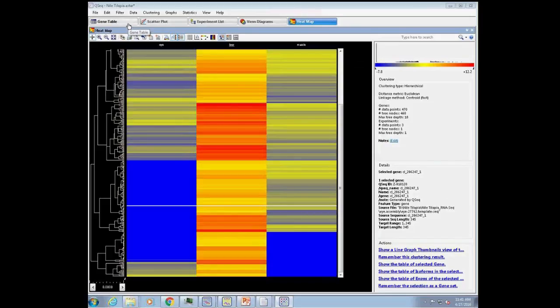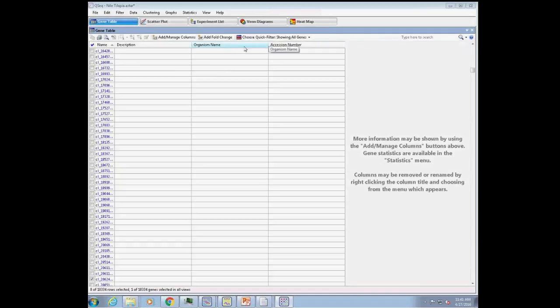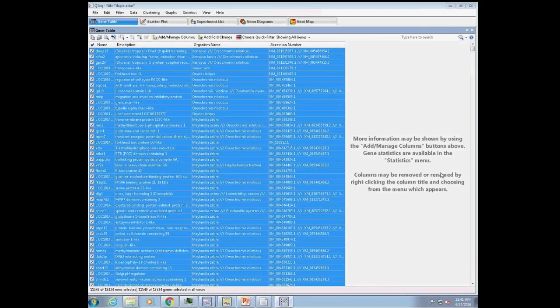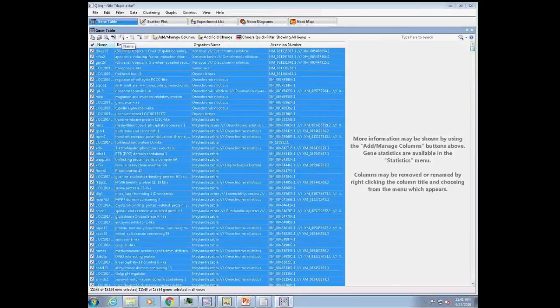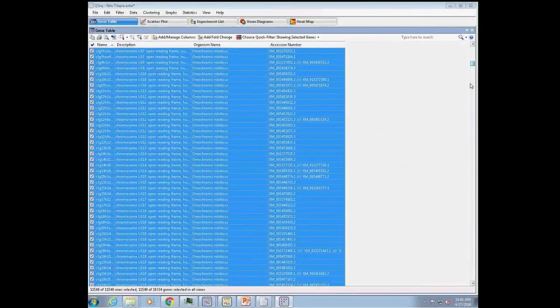So if I go back to my gene table, and I'm going to show all, and so again I have these novels, these unannotated genes. I'll sort again so we can just show that subset. We'll go to these CLs.